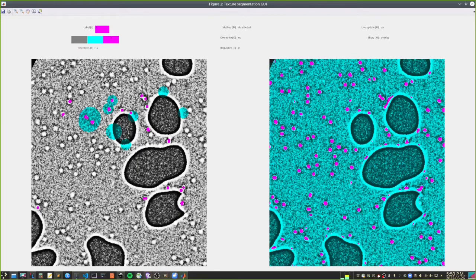Okay, so there's a little bit of mistake here. Whoops, it's not pink, it's blue. You can also erase. With the gray, you can erase. Okay, that's nice. Like here, I'm not really sure if it's a fiber or not, but I'm going to call it a fiber because it looks a little bit bigger than just a halo. I'm going to remove this little bit of mistake.